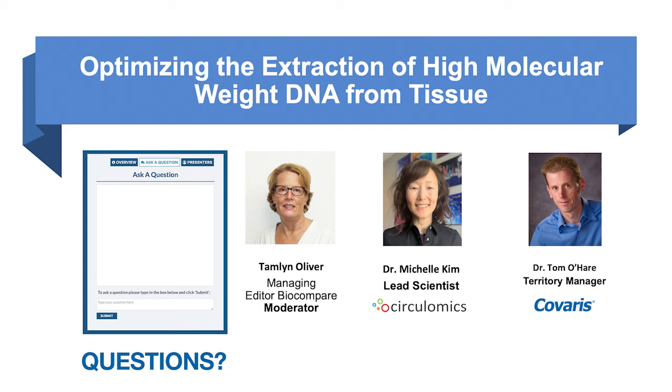What is the minimum amount of tissue that can be used with the protocol described? I was going to say, Sajel already mentioned 25 milligrams, and you can easily go down to 10 milligrams, and we do have larger size cryoPREP tubes that will go up to 2 grams. So the size of the samples can be quite flexible.